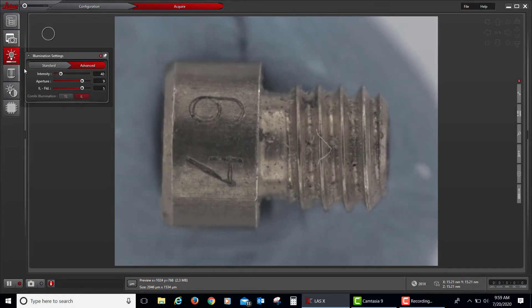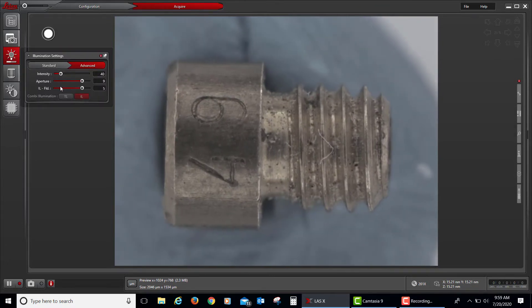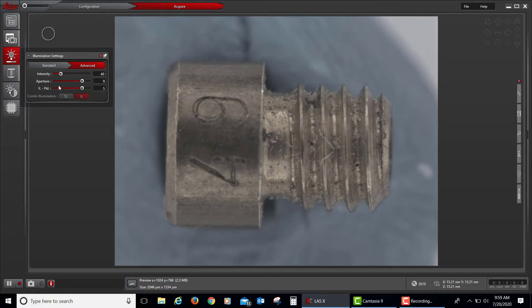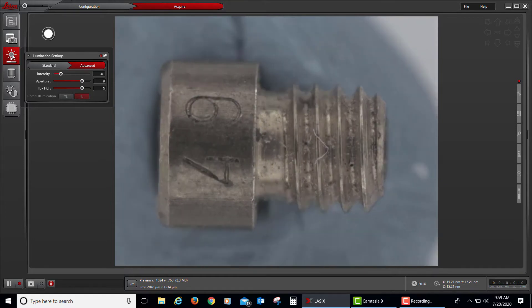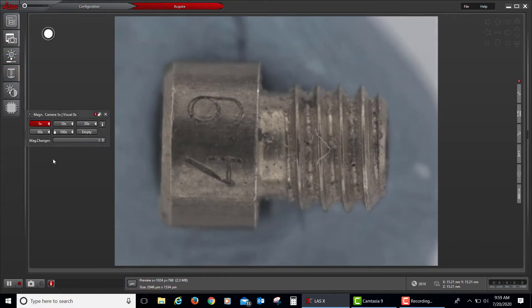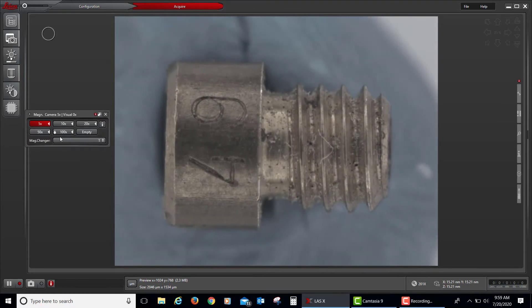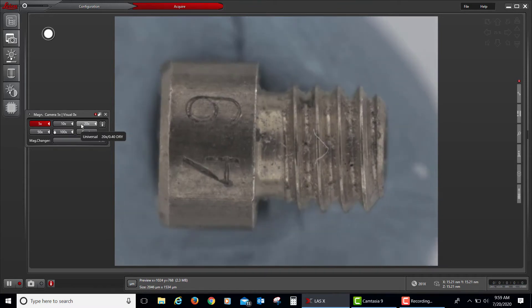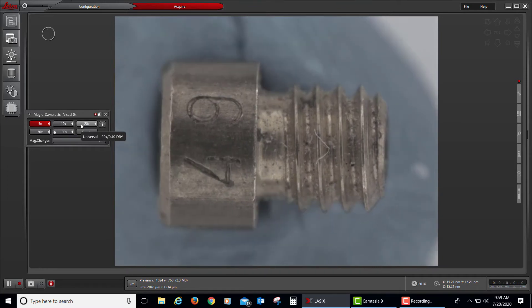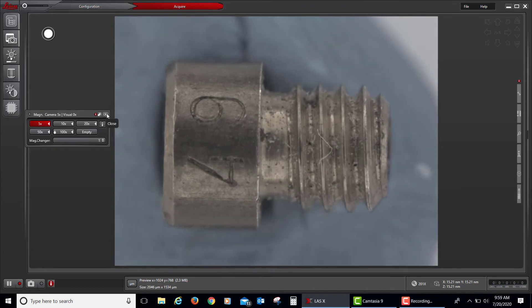Below that are the intensity and aperture settings for either your aperture diaphragm or your field diaphragm. Below that, if you have a compound microscope, will be the individual magnifications for each of your objectives. If you have a stereo microscope, it will be the zoom range that you have selected.